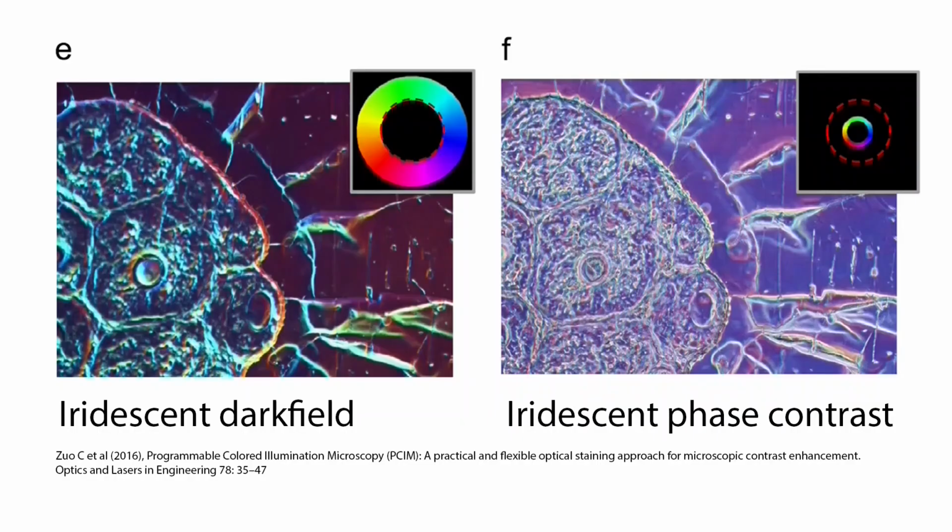Here we can see buccal cells in iridescent dark field compared to iridescent annulus phase contrast, showing colour highlighted edges. Opposite sidebands have different RGB intensities, so the effect on colour is equivalent to partial sideband suppression. We propose adding Fourier modulation to emulate the previous tricolour methods, or to create iridescent internal dark field with improved visualization of internal detail and with deep field.